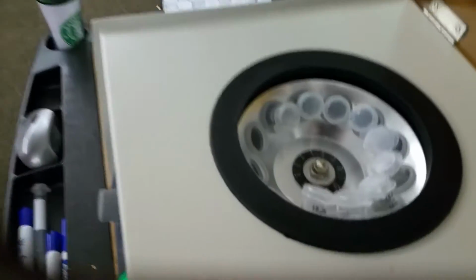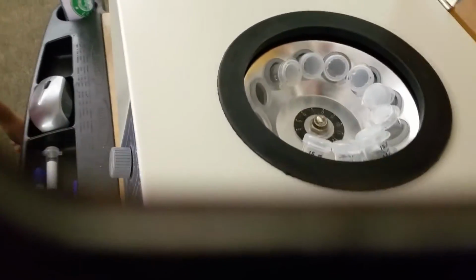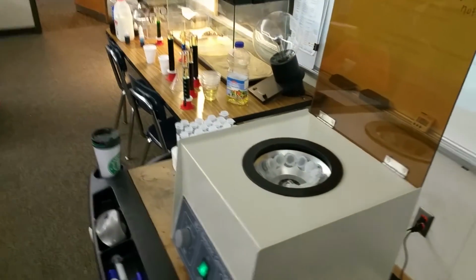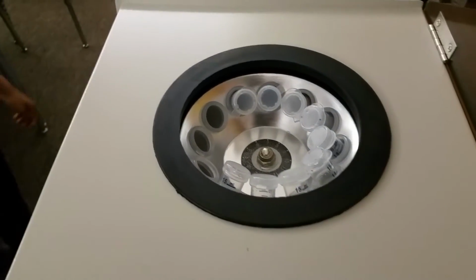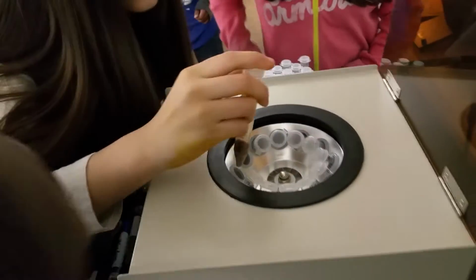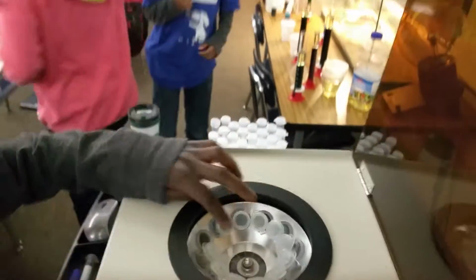Okay, now let's check and make sure that they're all evenly in there. We've got a few. I need 3 more people. Come on up here, Jerome. Giselle and Mary, come on up here. Add another test tube with sand. Let's put a couple more suspensions in there to separate, because when you run a centrifuge, it's got to be evenly balanced. It has to? Yes. There we go. Let's push that all the way in. That's good. Okay, one more. Come on in, Jerome.